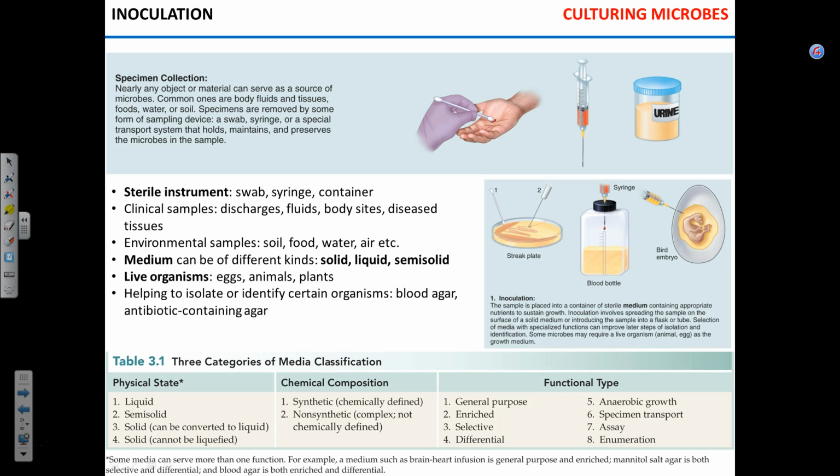When you did this with a cotton swab, what did you do essentially? What did you collect? A sample, yeah. So collecting a sample is the first step of inoculation. Since we talk mostly about clinical aspects, say you're swabbing, or you're collecting somebody's blood, or somebody's urine.